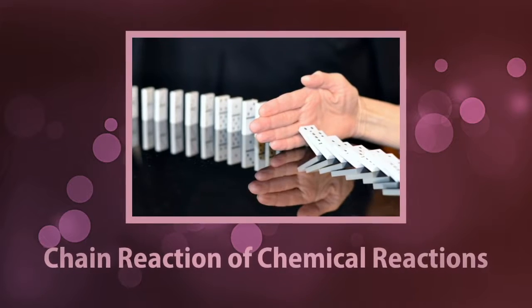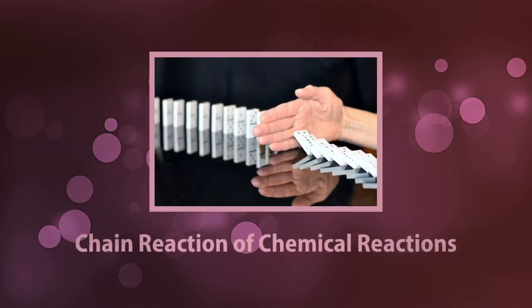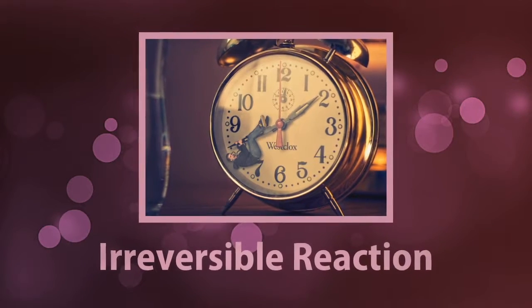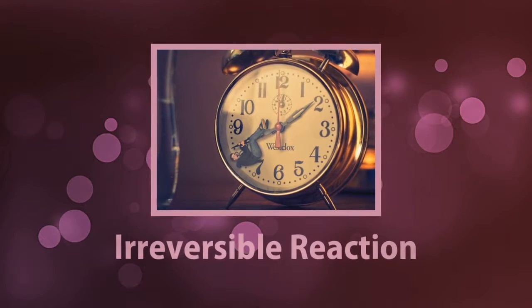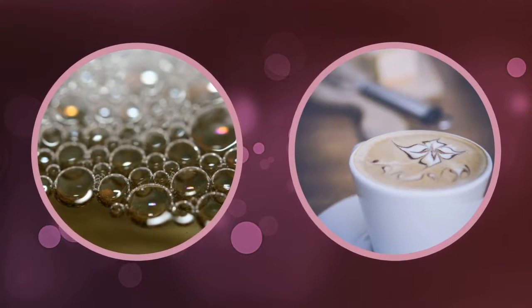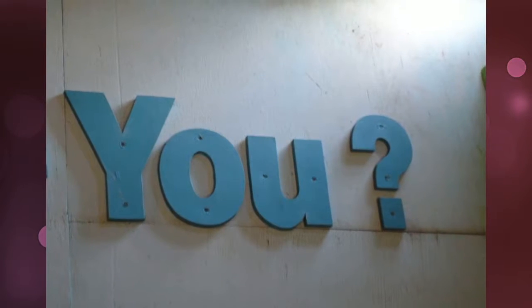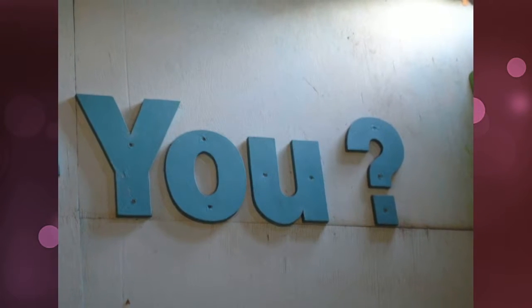The chain of reactions that occurred were like dominoes and eventually produced the black solution. This experiment is also irreversible, which is another indication of a chemical reaction. Other chemical reaction indications include gas production, change in temperature, and precipitation. So, where do you find chemical reactions in your everyday life?